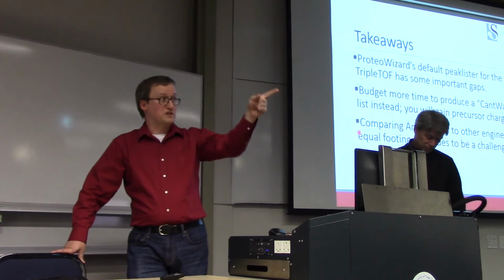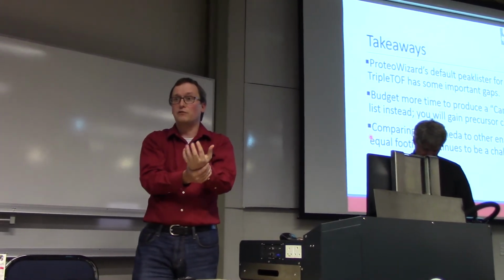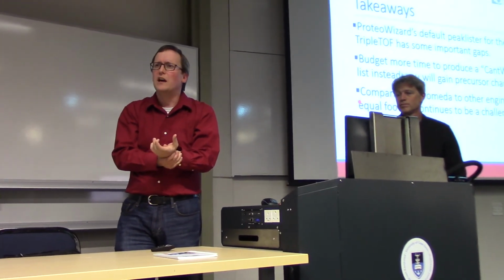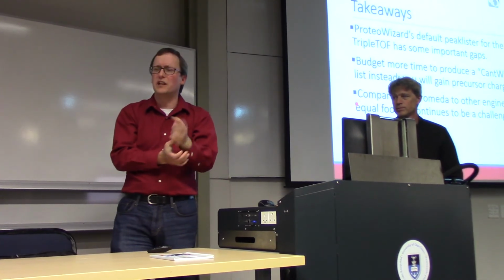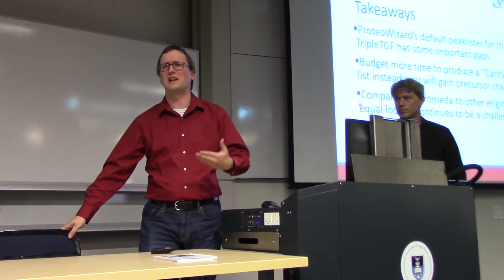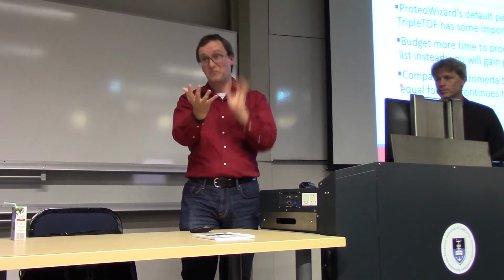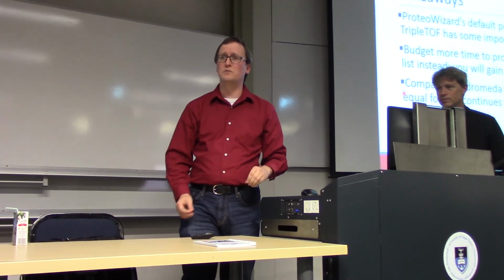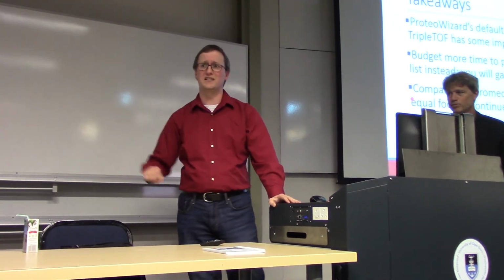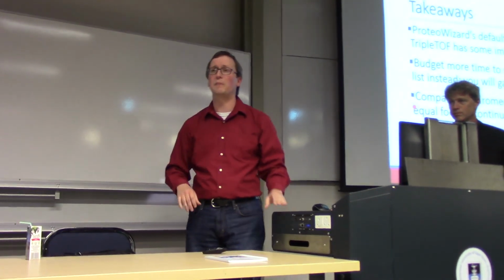Now, folks such as the MacCoss Lab have worked at doing this in situ peptide identification from data-independent volumes. They created an algorithm called Pecan. I don't know if it ever got published, but I think it got discussed at ASMS, and I think they've written a successor to that they think is much better. So being able to identify peptides in data-independent volumes will come along, but this is not where most people in proteome informatics have been working. There are a lot more people dogpiling into that space now, so I think that might get better.